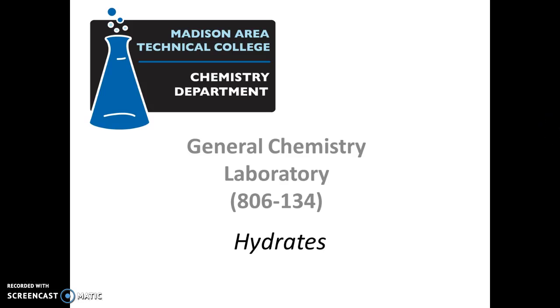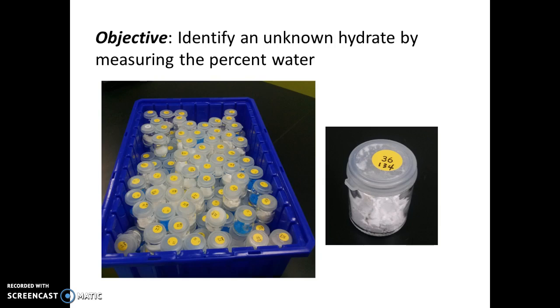This video discusses the procedure for the Hydrates experiment for general chemistry at Madison College. The objective of this lab is to identify an unknown hydrate by measuring the percent water.